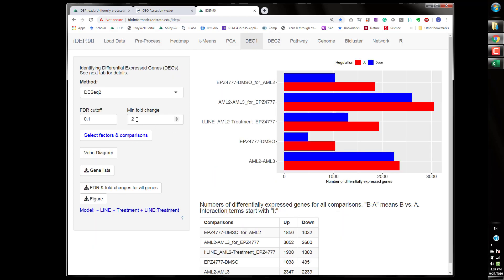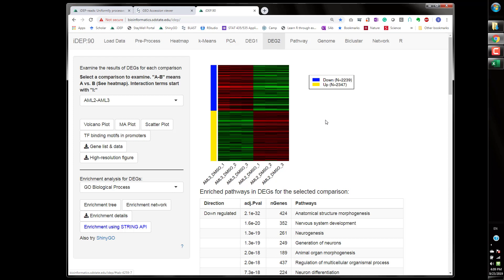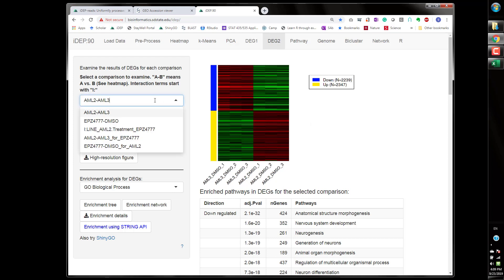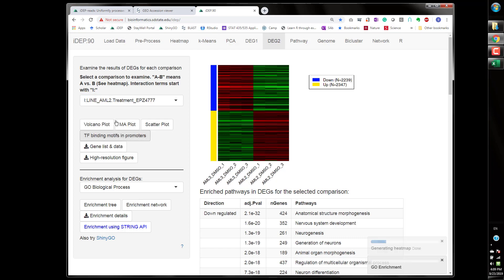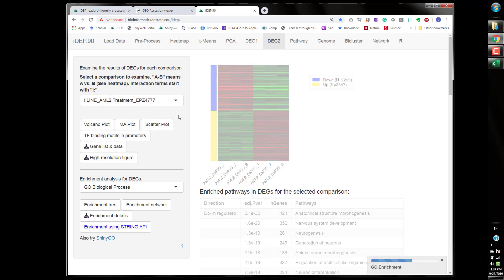If there's too many genes sometimes you can change these fold changes here. Okay so the second term is the difference between the treatment versus the control in the reference level for cell lines. In our case ML3 is the reference so for ML3 the difference between treatment and the control.